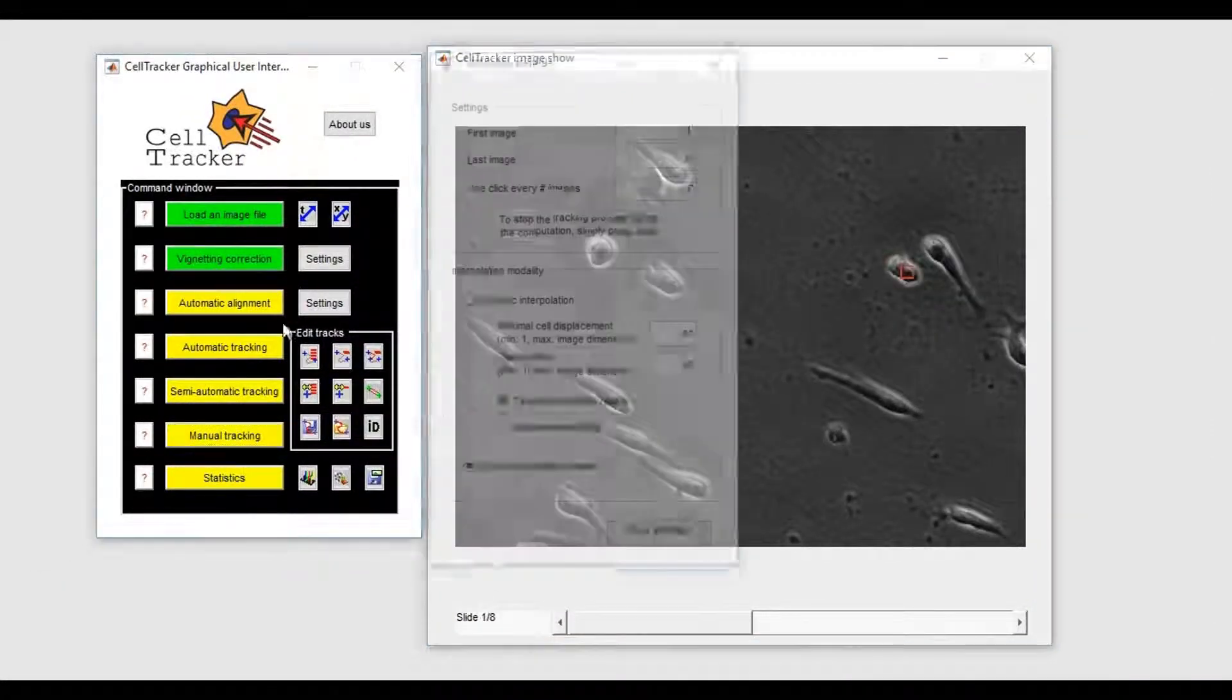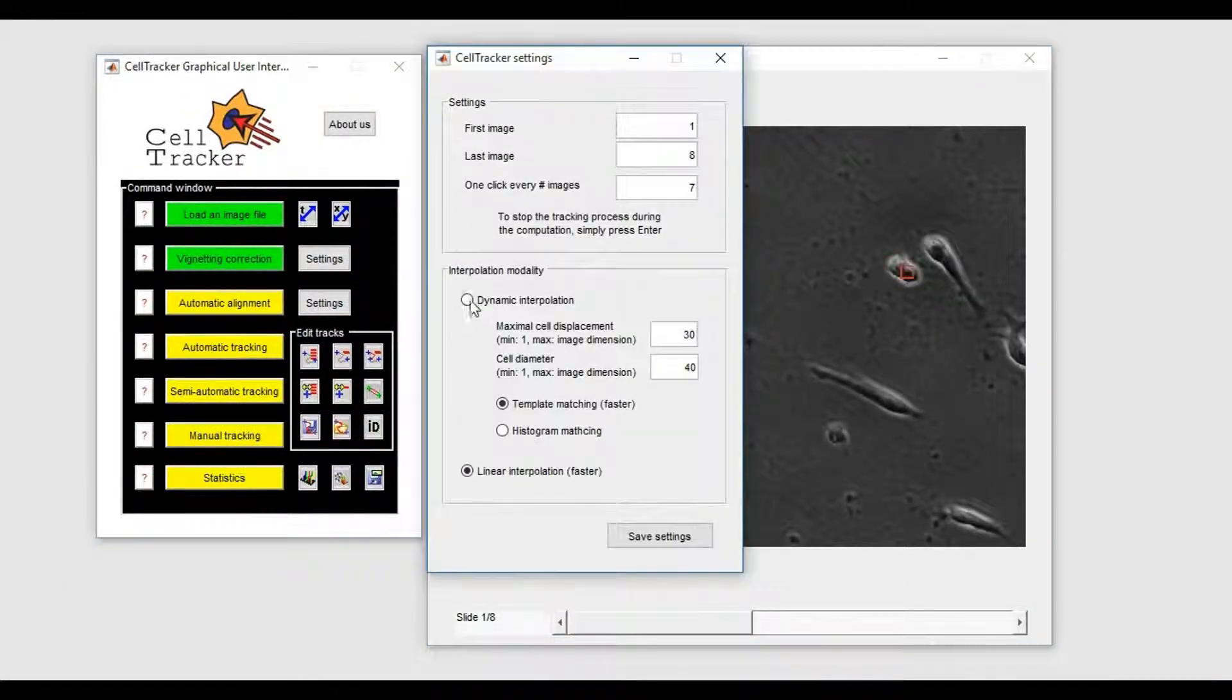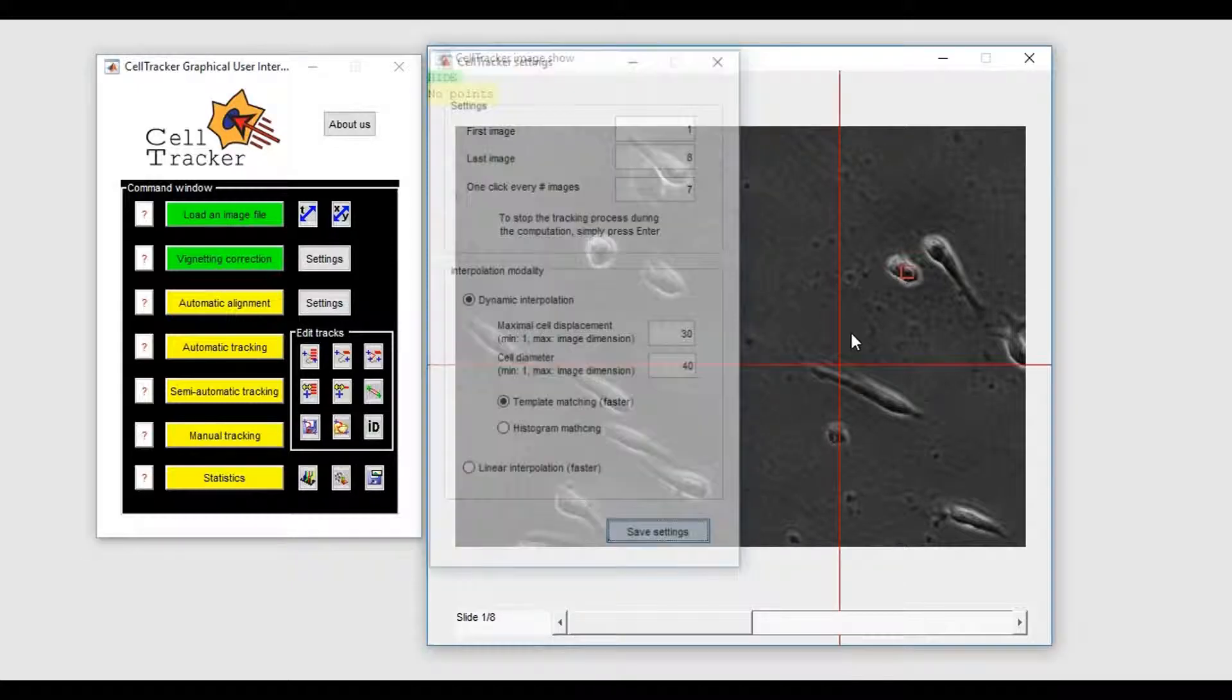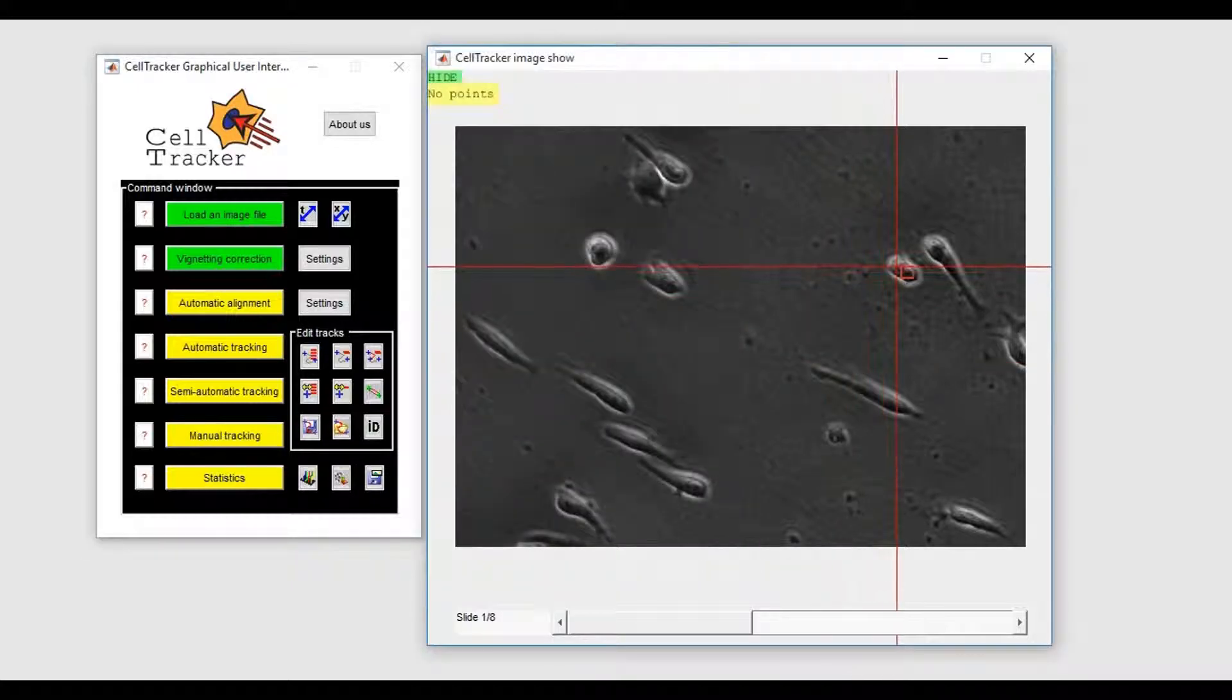Meanwhile, dynamic interpolation is able to correctly follow the cell.